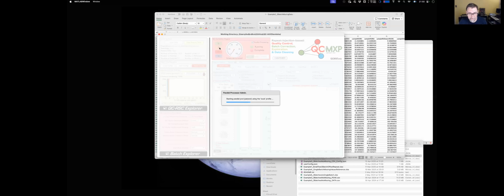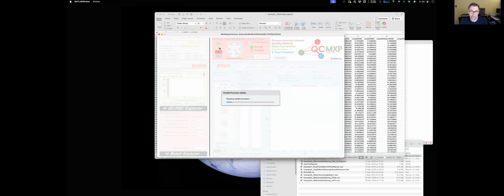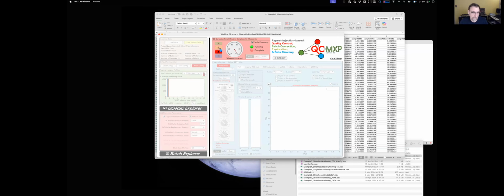So this is doing what the question's asking. If you don't do a QC, then you can use it, but it's got limited utility, because it's almost stupidly important to do a pooled QC or some sort of reference sample, or else, irrespective of the batch correction, you're never going to know the quality of your data set. You're not going to know how reproducible your data is unless you run some sort of repeat. Now, you could do replicates, which is fine, in which case this wouldn't work unless you do it on the sample, but doing a pooled QC.